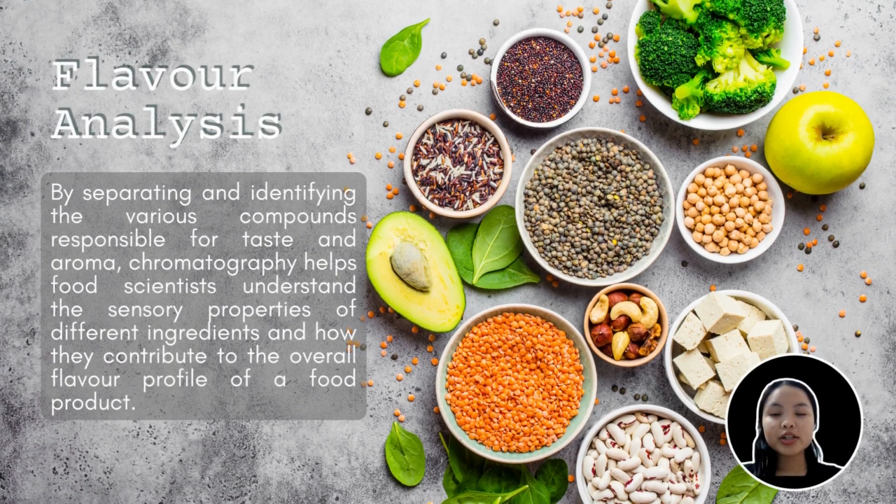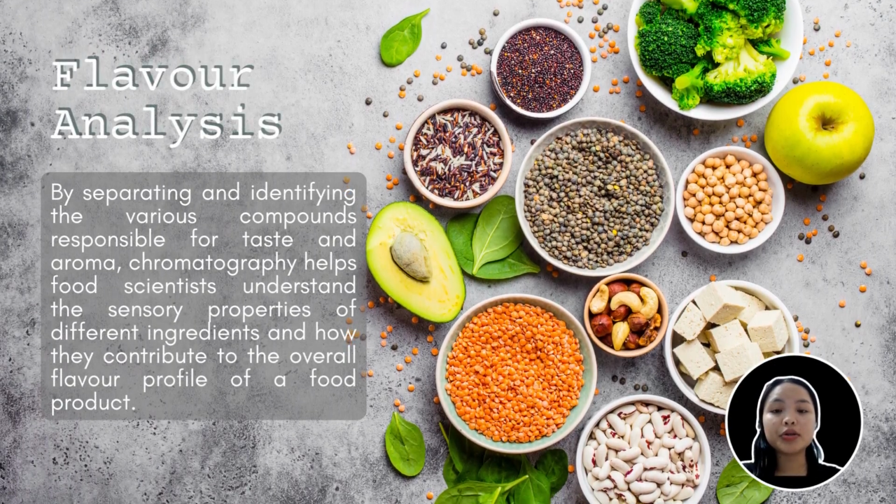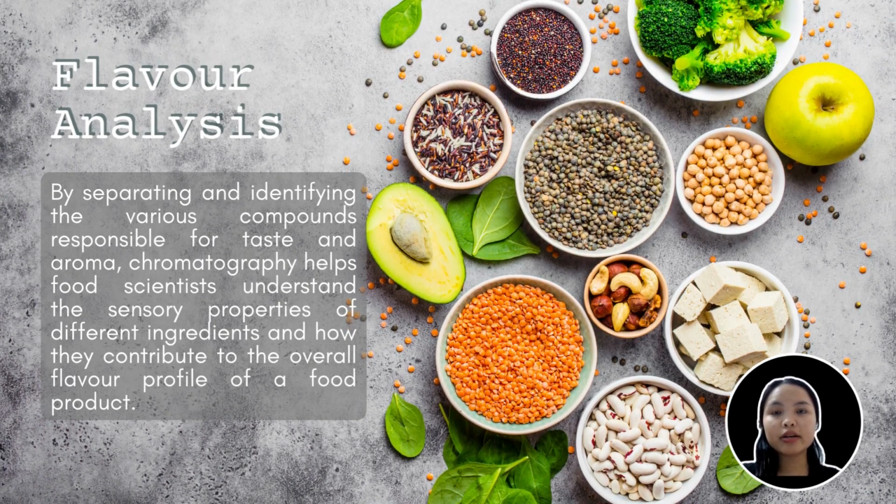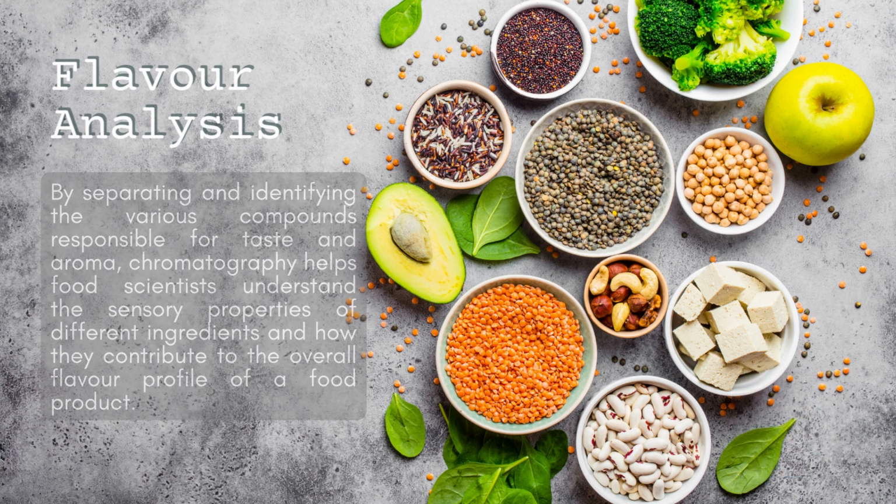Another application of chromatography in the food industry is in flavor analysis. By separating and identifying the various compounds responsible for taste and aroma, chromatography helps food scientists understand the sensory properties of different ingredients and how they contribute to the overall flavor profile of a food product.